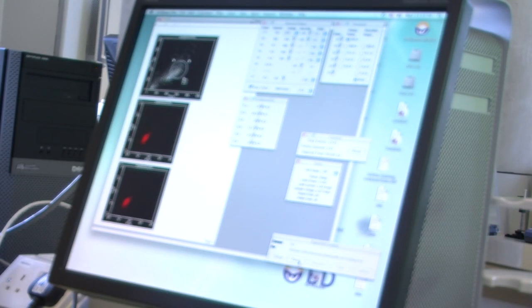The final one, tube one, the final person, tube one went through in 31 seconds. Good cell retention there. So we have a winner then. We have first place and second place. Okay, that's good. But what I would say is everyone's had really good cell numbers. No one has sort of butchered their pellets, as in we're having to wait 10 minutes to just about scrape a few thousand cells.